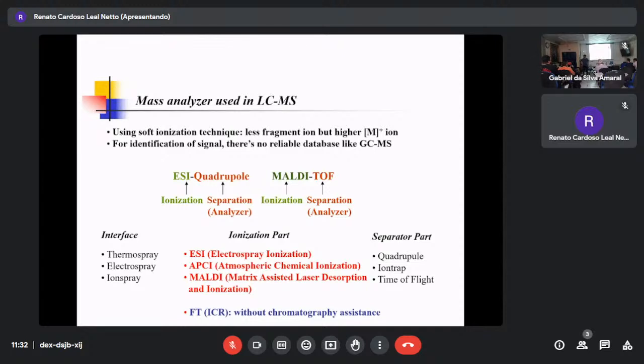And also imaging. For quantitative analysis, no. Small molecule quantification is like imaging basis. It's like when you take an iPhone photo: it's not quantitative, but it's no problem to recognize.